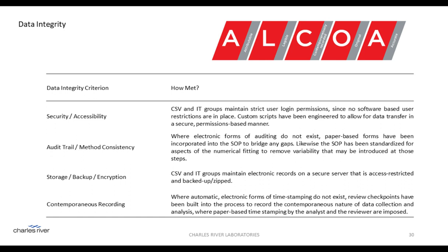The AUC assay has not had the head start in this area that other assays like HPLC have had. AUC, of course, has primarily been a strictly R&D tool for most of its history, but it's been a very important tool. It's been a critical part of life science research for many decades, but it has never, until now, really been needed in a regulatory compliant way.